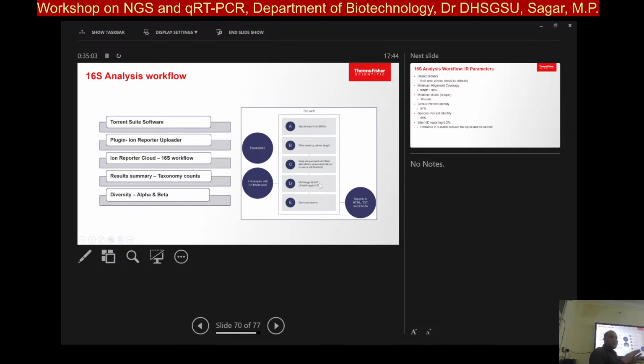So ये स्टडी यहाँ पे डाइवर्सिटी, alpha diversity would tell you whether it's highly diverse sample or highly conserved. So अगर 100 नहीं आ रहे, 10 स्पीशीज आ रहे हैं, so that is going to be very conserved kind of thing. 100 स्पीशीज आ रहे हैं और काउंट्स अलग अलग है, that would be diverse kind of thing, because सब स्पीशीज अपने आप को वहां पे they are trying to perform. That's how it is. So that is alpha.